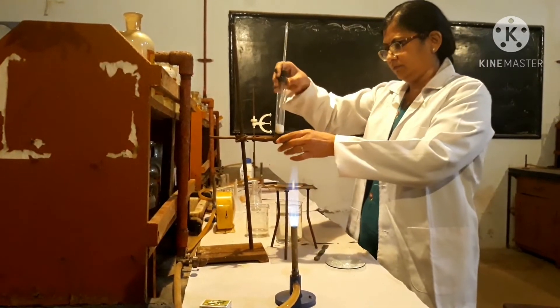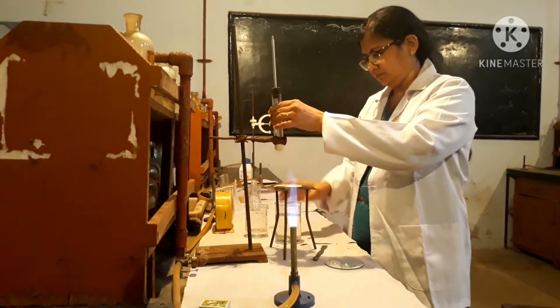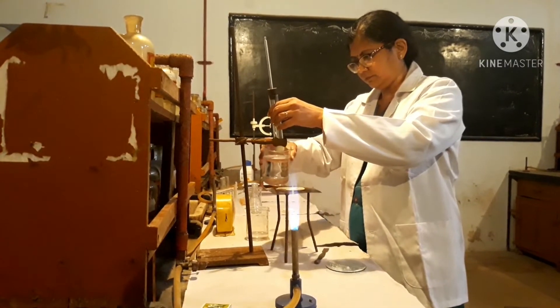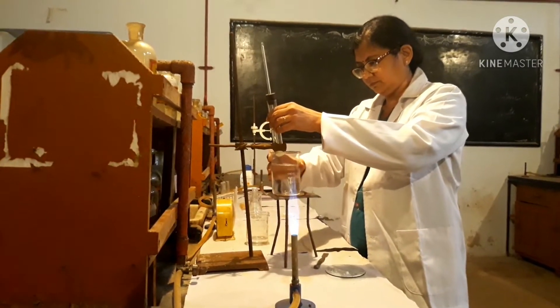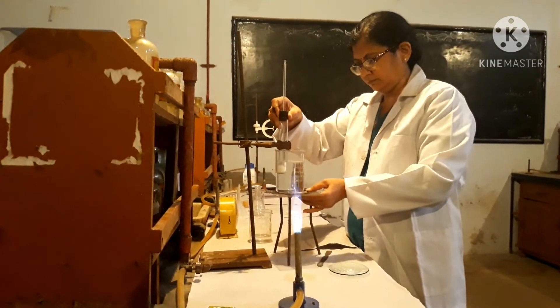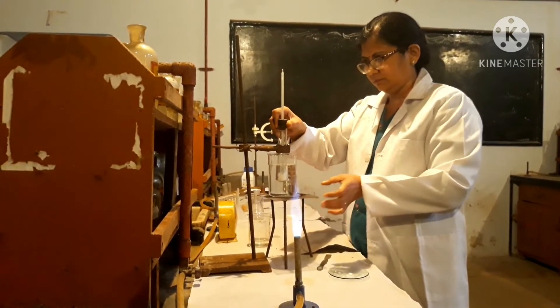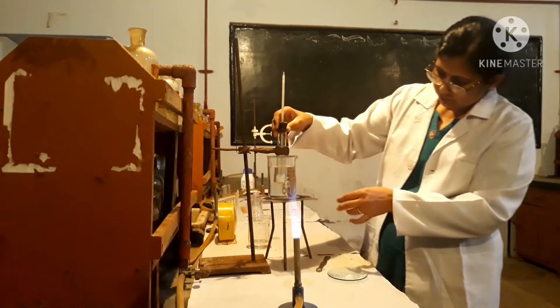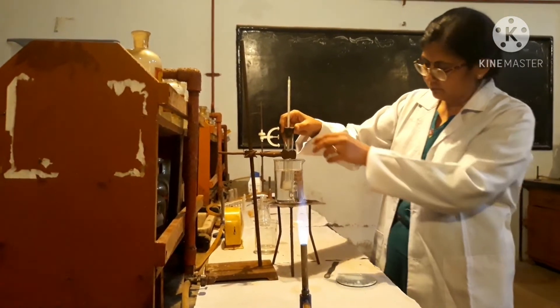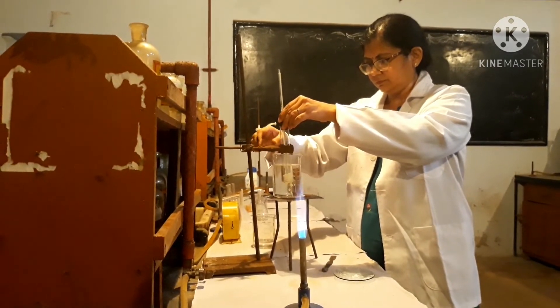Now insert the thermometer through a cork. The mercury bulb of thermometer should be completely surrounded by the salt. The mercury of the thermometer will be at room temperature, that is approximately 25 degrees Celsius.